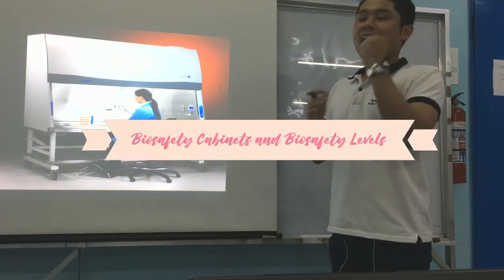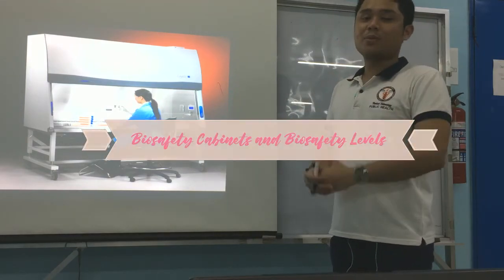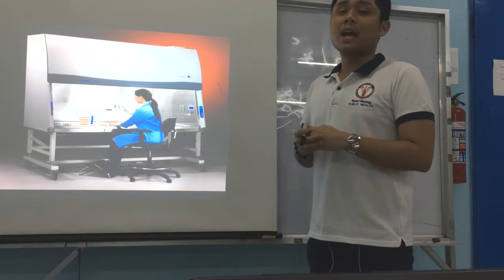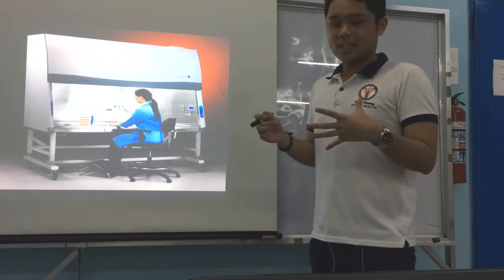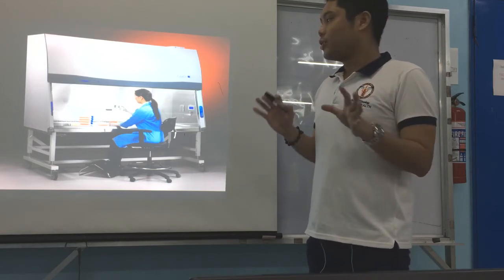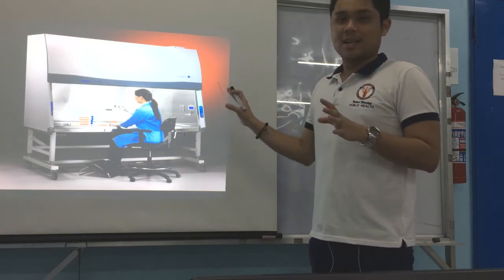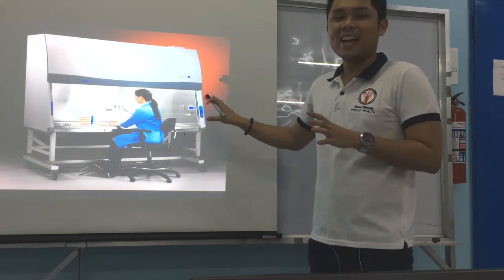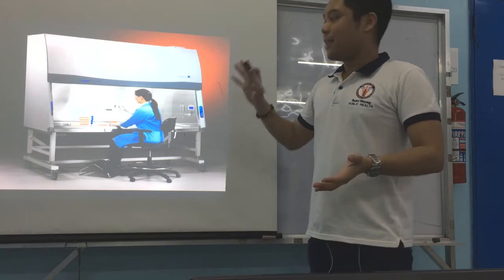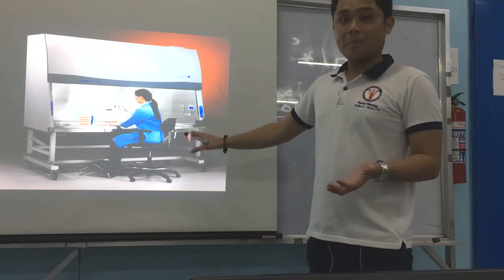Hello, my name is Sir Mark, and I'll be your lab preceptor for this particular course, which is clinical bacteriology. Now, for today, what we're going to discuss is something quite unique to the bacteriology laboratory in terms of laboratory safety, because in other sections in the laboratory, you don't usually see this. See this machine? It's usually found in the microbiology or bacteriology laboratory, and this is what we call your biological safety cabinet.